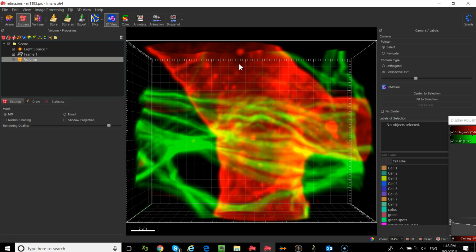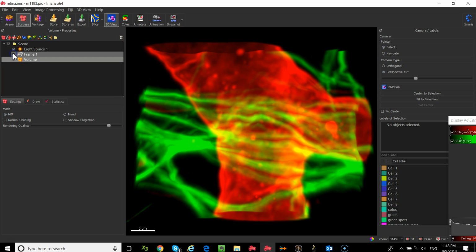That is there to give you that 3D perspective. It's also there for some people for the purpose of measurement. There's a grid pattern in there. People that are tracking like to have some kind of a reference. So if you don't like that frame, you can turn it on and off. Okay, especially for snapshots and movies, if you want to remove it, you can turn it off over on the left-hand side.